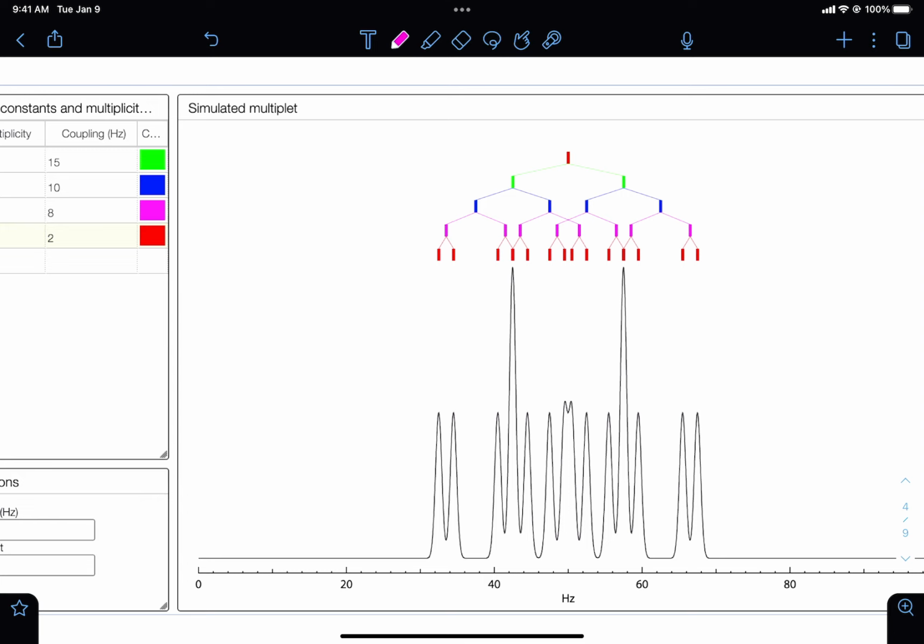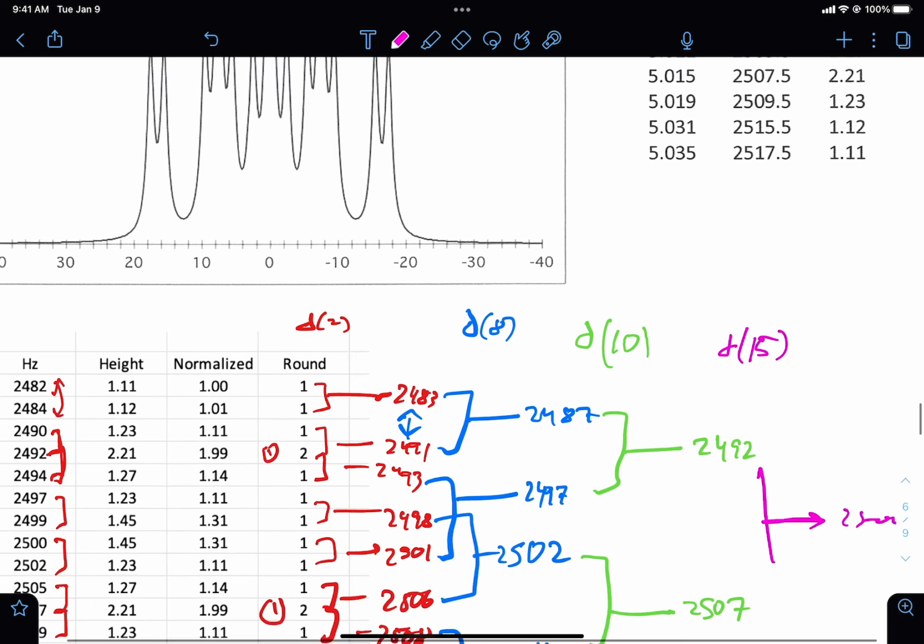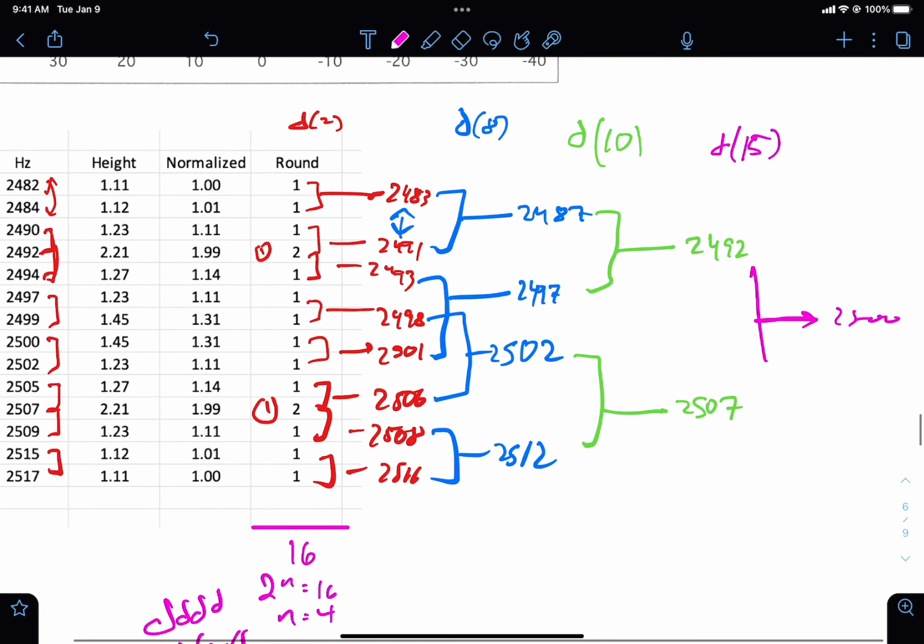Remember how we overlapped our doublets in that 3rd tier? If we go back and look here, our blue, we had overlapping doublets. We work from the bottom, but we look at it from the top. So our 3rd tier from the top, the pink to green to blue, those were overlapping doublets in the middle.